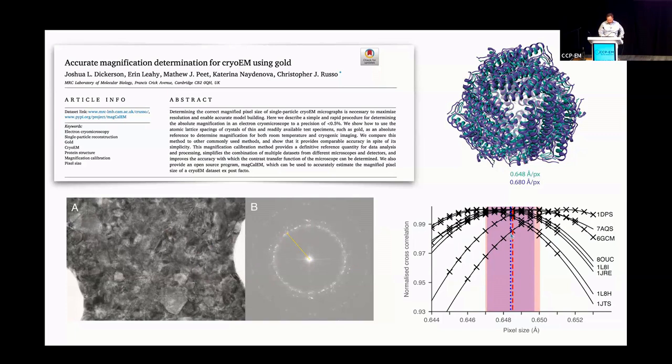In fact, you can do better than you can with X-ray maps, or at least as good. And there's one other fine detail here. Lots of people use an apoferritin crystal structure, and then cross-correlate it into a map that's determined at a particular magnification, and then use that as their absolute pixel size. But this is a slightly dangerous thing to do, because if you instead look at, say, DPS, where there are lots of crystal structures in the database, you'll find that they have different magnifications. And in fact, they have different sizes.